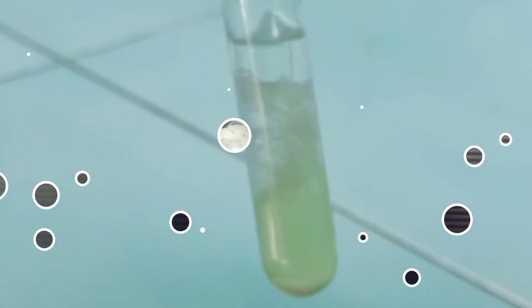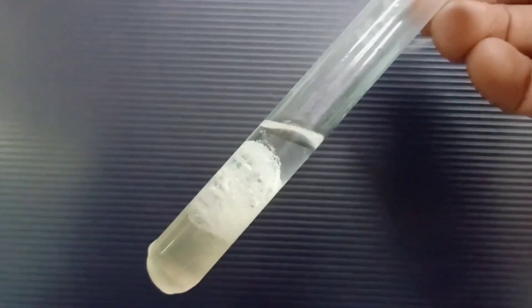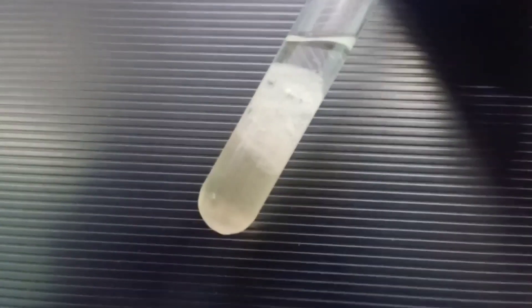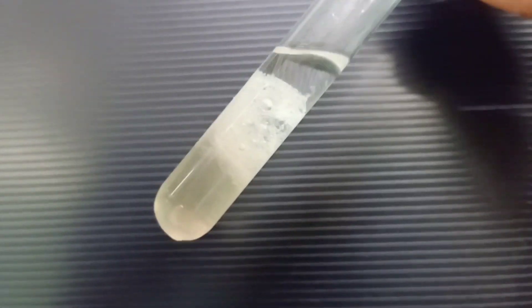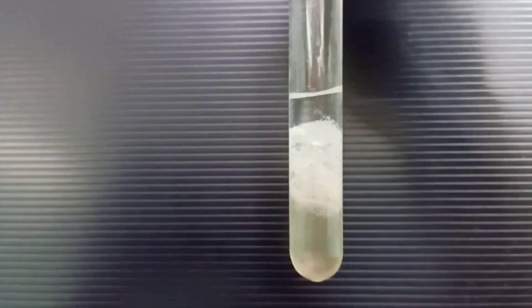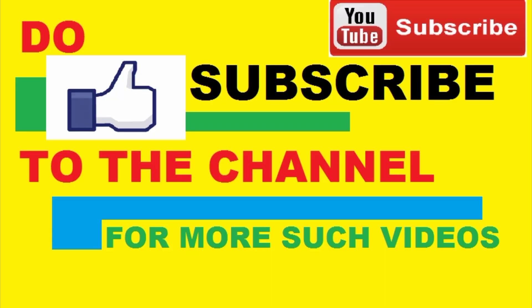You can see whitish thread-like filaments — this structure is the DNA. This is not pure DNA, but it is sufficient to show to your examiner. You can take it out using a spoon, which is called the spooling of DNA. I hope you understood the DNA extraction principle in an easy way. Don't forget to give a like — thank you very much!